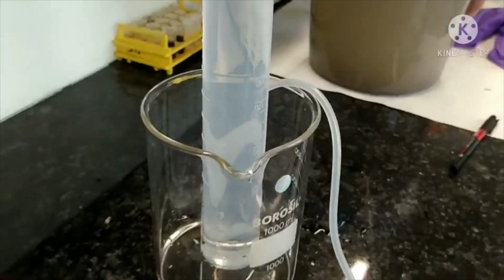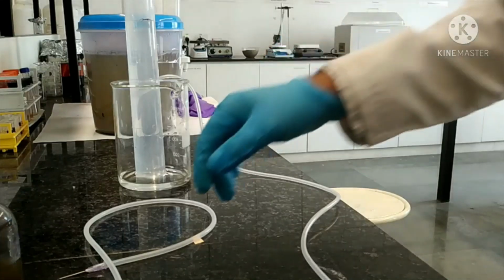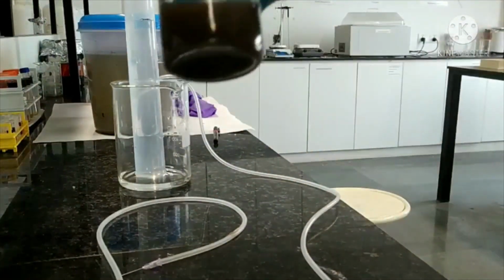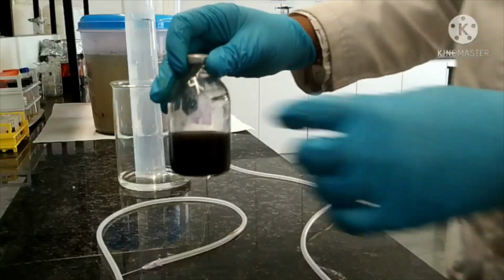Now we will check the gas. So this is the whole setup we have already done with this serum bottle, and then the inoculation and all the generation of the biogas. Now we are going to check it.